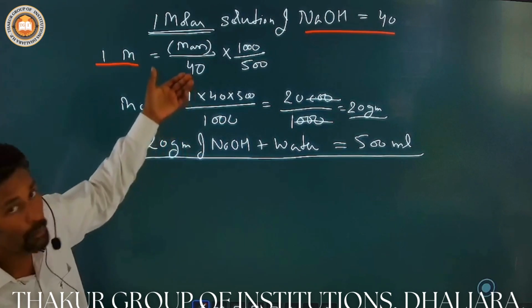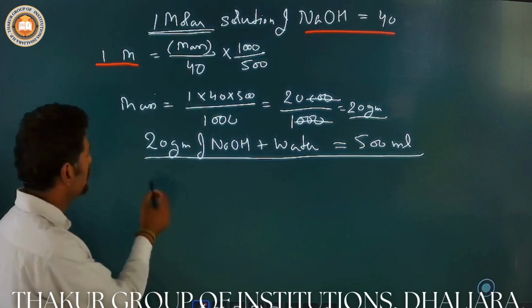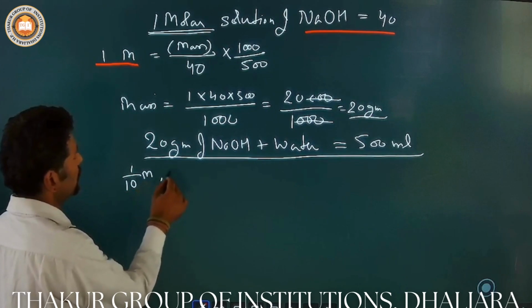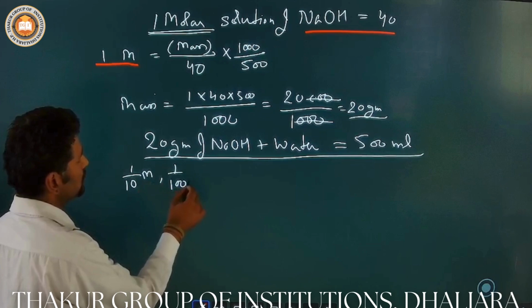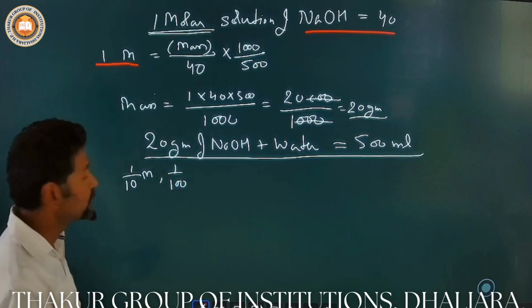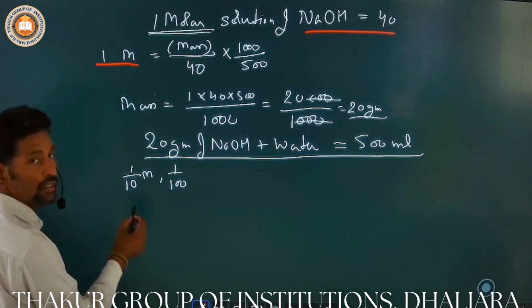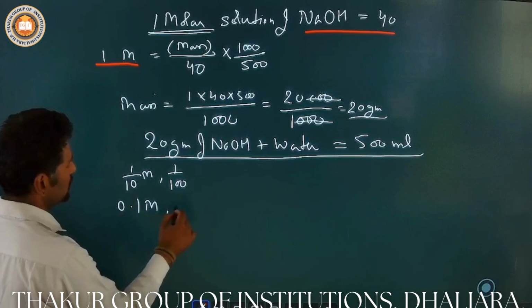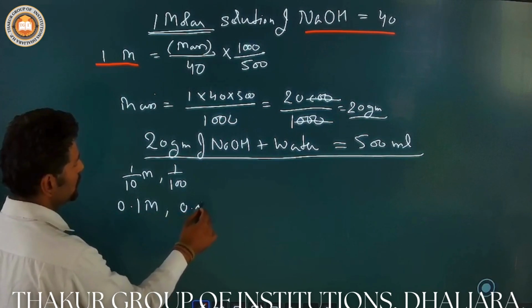Similarly, if you want to prepare a 0.1 molar, or 1 by 10 molar solution, 1 by 100 molar solution, or 1 by 1000 molar solution, you can prepare them respectively in the same way.